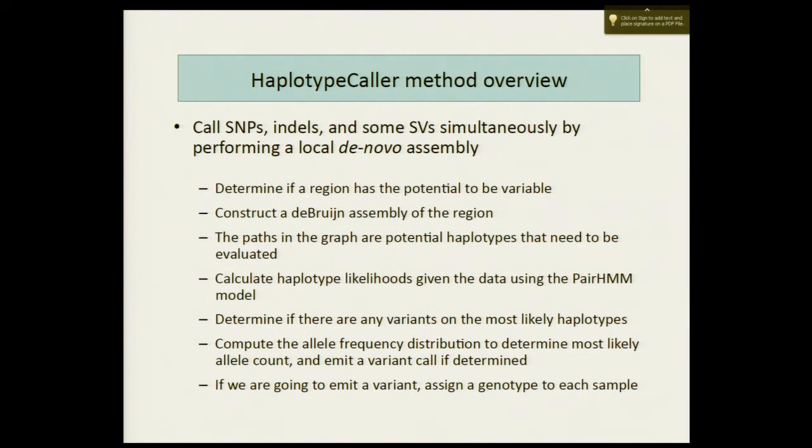So it does a lot of things very well, right? But for things like more complicated indels, larger indels, for example, it does a pretty poor job, right? Just because it's trapped in a per locus view, it has these limitations. And so the examples I'm going to show you in a few seconds are all examples where the unified genotyper does poorly. But in general, for calling SNPs or for calling smaller indels, the unified genotyper does very, very well. And it's been our workhorse for a long time. So things always get better, right?